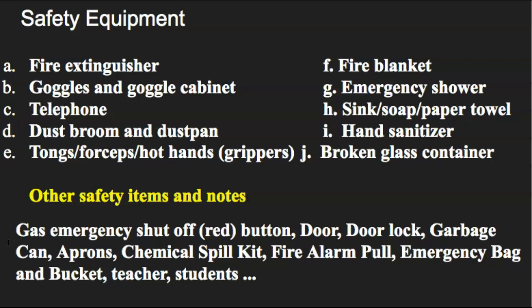The chemical spill kit. We'll talk about this a little bit in class, but that's what your teacher will use if we're ever using strong acids or bases. It's an expensive kit, so we don't use it for everything. Some things we can just dilute with water and we're okay. But if it's a strong acid or strong base, your teacher will use the cleanup kit to clean it up for you. This will be indicated in the pre-lab discussion as to whether you can clean up the materials or whether your teacher has to do it.